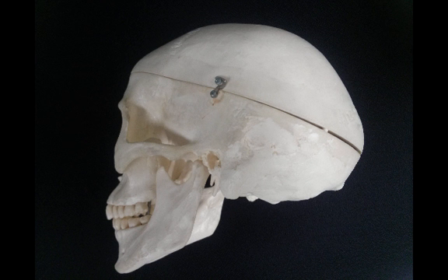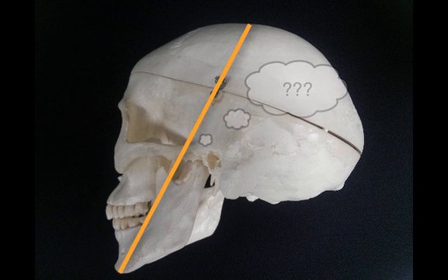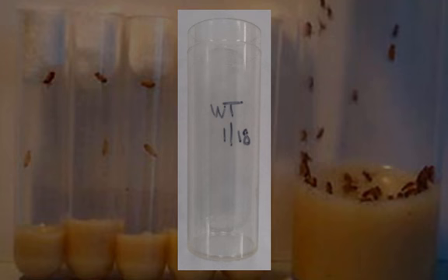Scientists like to make measurements, like this skull. If you were asked to measure the height of this skull, how would you do it? And what about this fruit fly culture vial? What tool might you choose to use to measure its height?